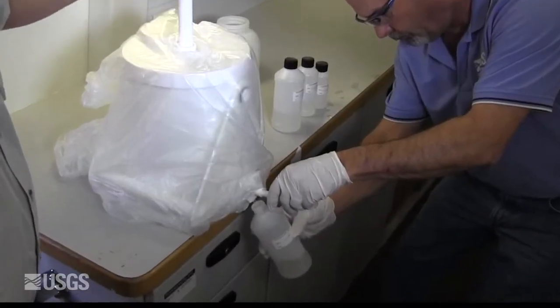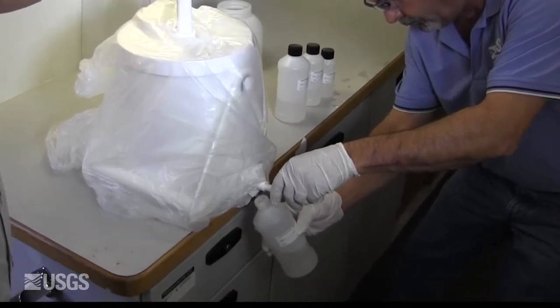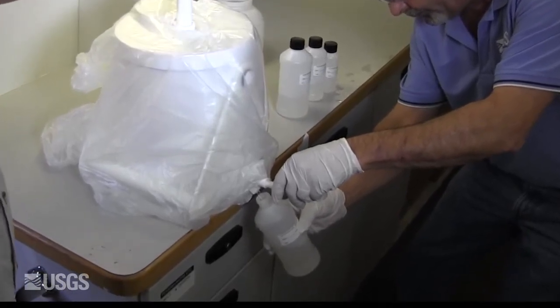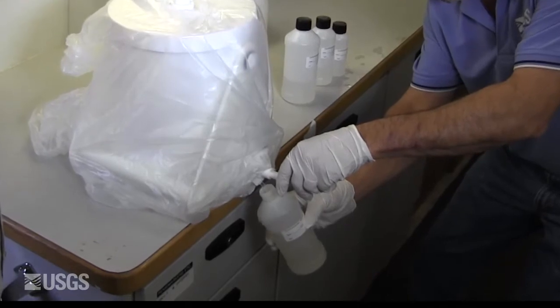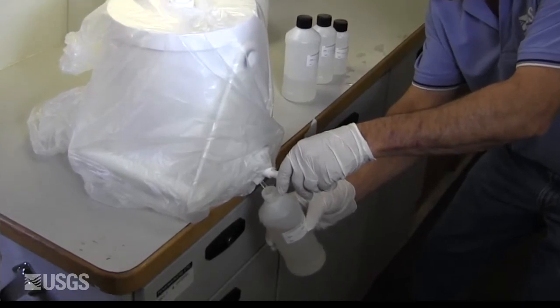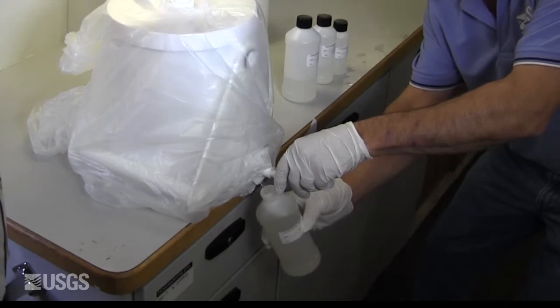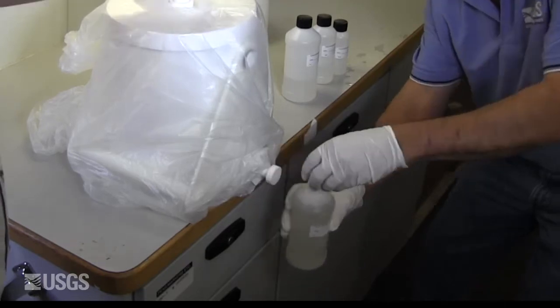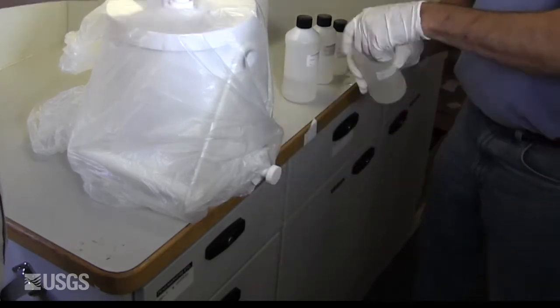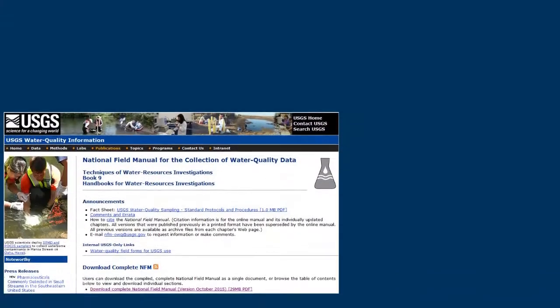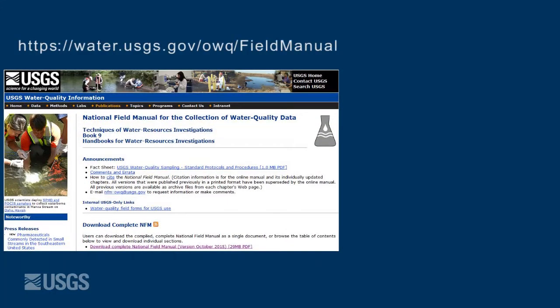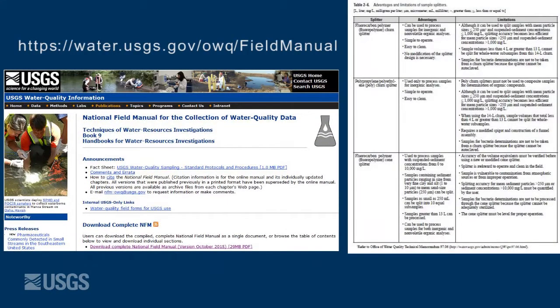Churn splitters, or churns, are used to combine subsamples as they are collected from several points in a stream or river. The churn is then used to split the combined water samples into sample bottles that represent the suspended and dissolved concentrations in the stream or river. The advantages and limitations of churns are described in Table 2-6 in Chapter 2 of the National Field Manual.